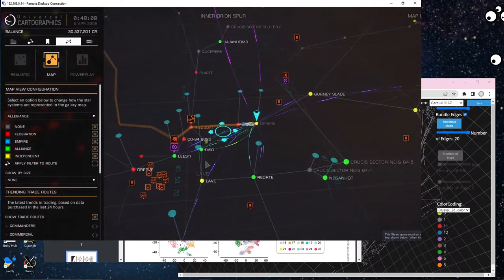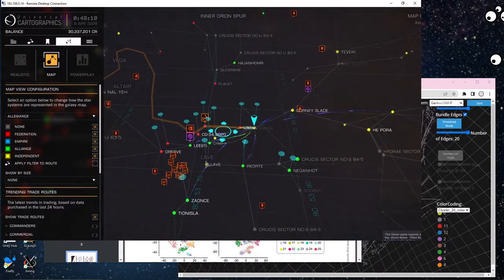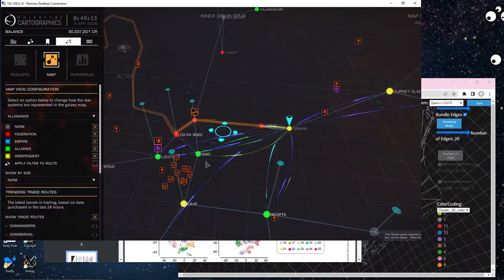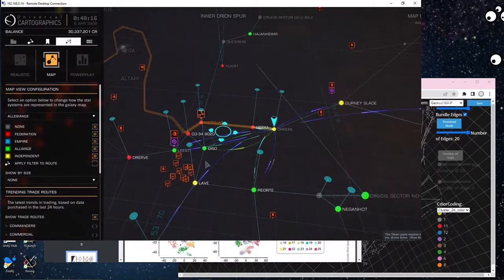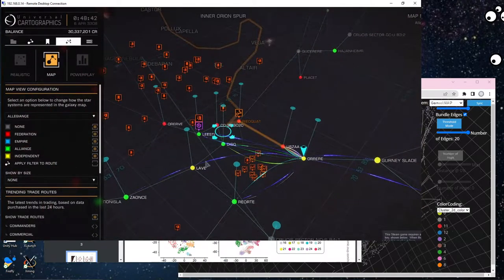But I think that the representations of the gene product interactions, the protein-protein interactions encoded by the genes represented in the dimensionality reduction or tSNE representations could be visualized this way, and the colors and the rates and the thicknesses of these edges could signify the strength and the type of protein-gene interactions, and also they have this route here.